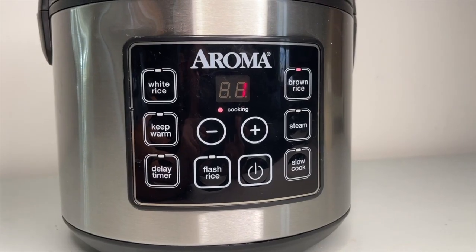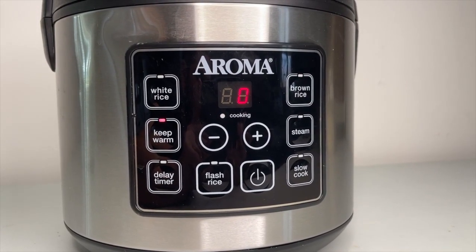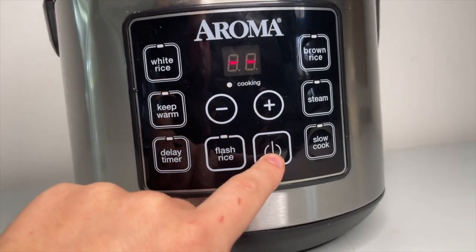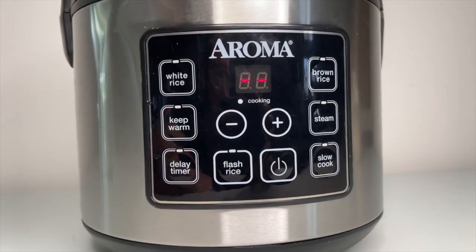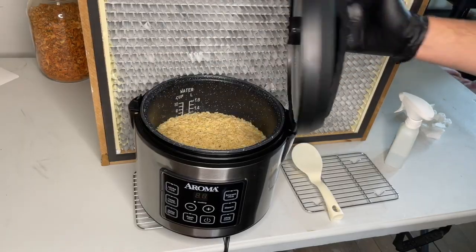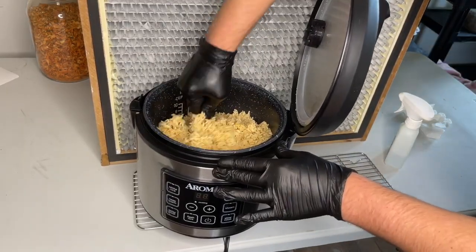After the cycle has finished, you will have to shut it off yourself or it will keep it warm and burn the bottom. While it is still hot, open up the rice cooker in front of a laminar flow hood and stir it with a sterile spoon.